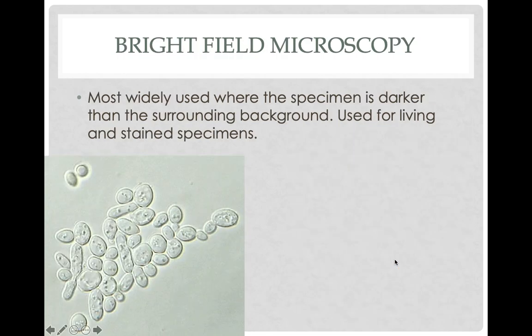So there's a couple of different types of microscopy that's found in microbiology labs. Microscopy is just using a microscope or using microscopes to do things, or the study of using a microscope and things like that.